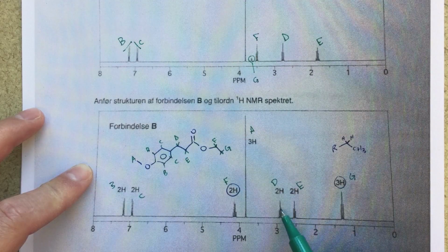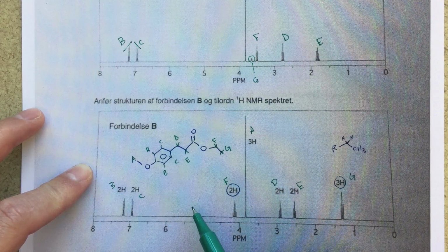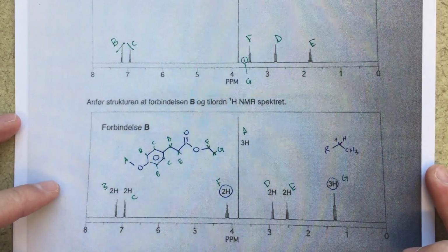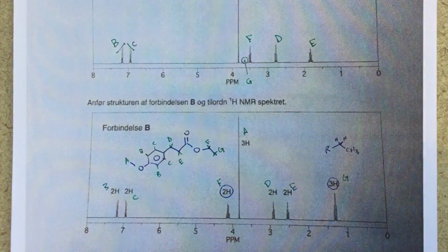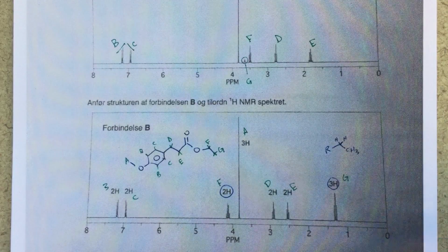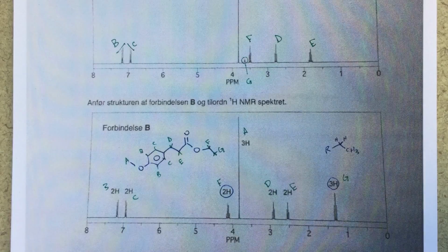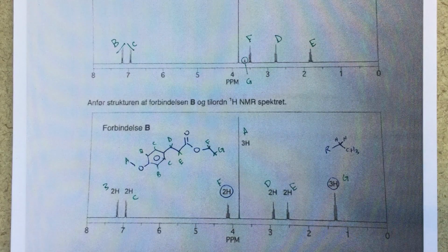These are triplets, so I see a triplet. So for D, it should be a triplet. For E, it should be a triplet. This first guess was a good first guess. And if your first guess isn't a great first guess, that's okay, right? But you really have to make a first guess and then break it down, see if it all lines up and makes sense. If you have further questions about this video, if there's something that isn't clear, or you think I've made a mistake, let me know, and keep studying.